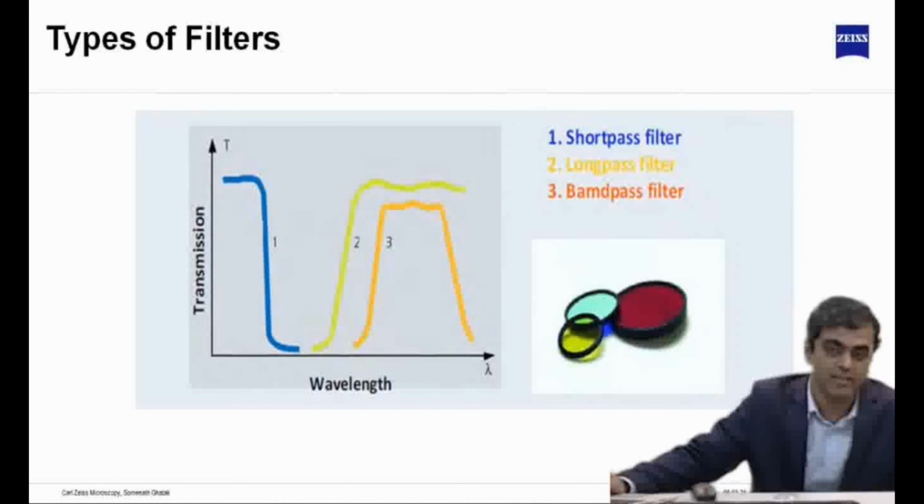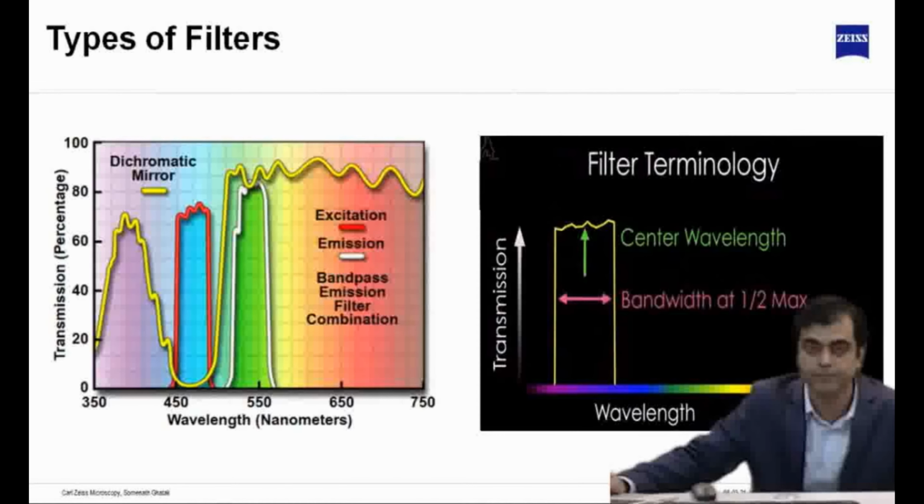But to have a basic idea, you should understand what all filters are there and see it in a wide field before coming onto a confocal system, so that you have an idea what the signal is that you are having in your sample.